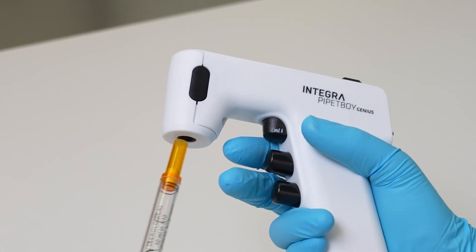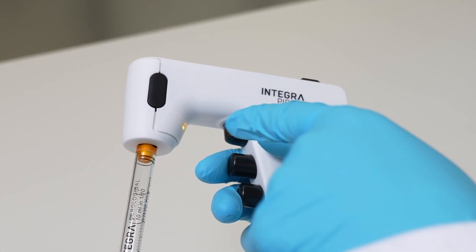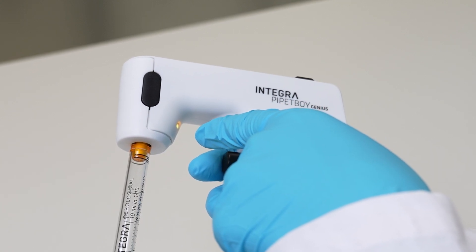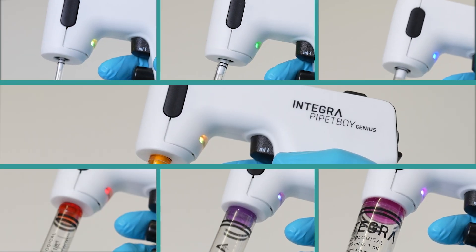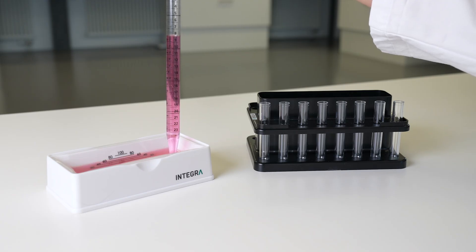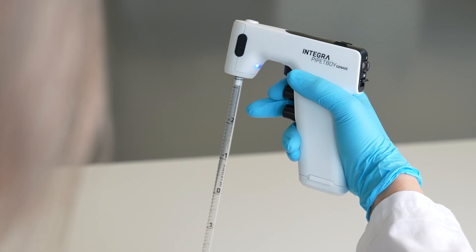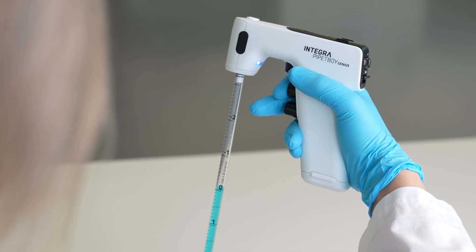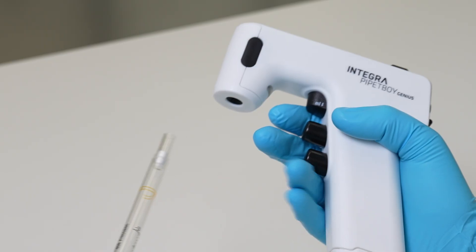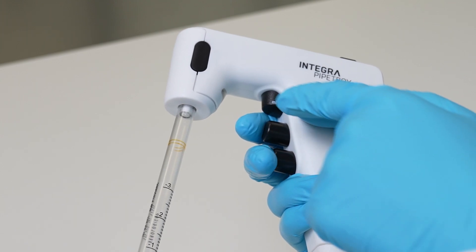Any serological pipette can be used, but when using Integra pipettes specifically, the indicator will light up the same color as the pipette to show that the Pipette Boy Genius has detected the correct pipette volume. Using Integra pipettes allows you to use the unique repeat dispense mode and benefit from overfill protection. Other brands of pipettes will not be detected but can still be used in manual mode.